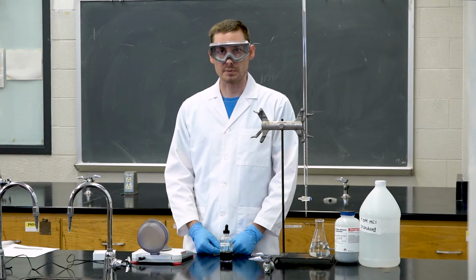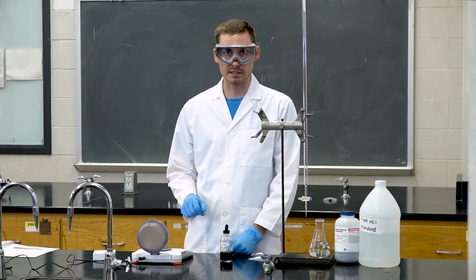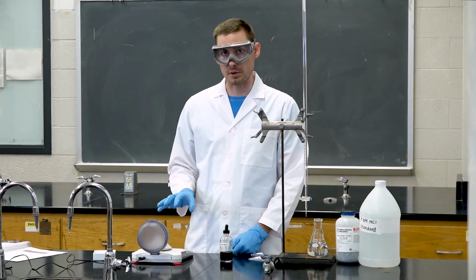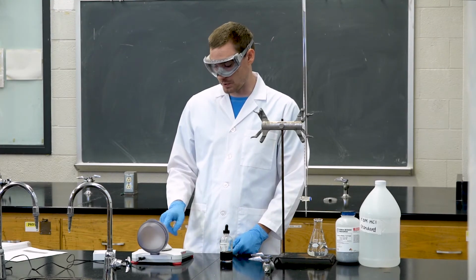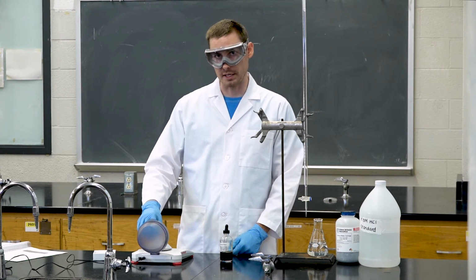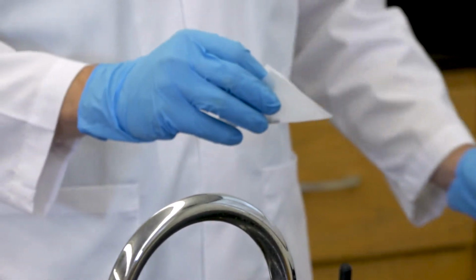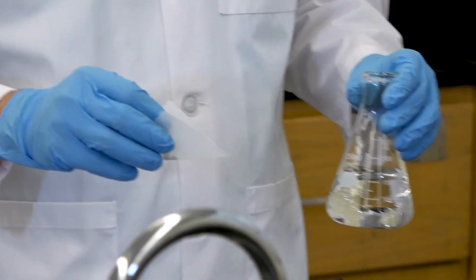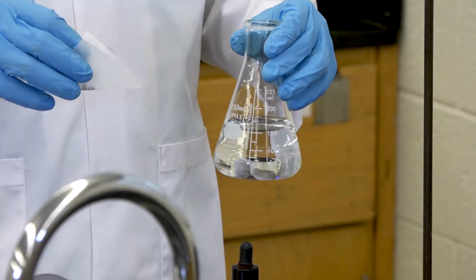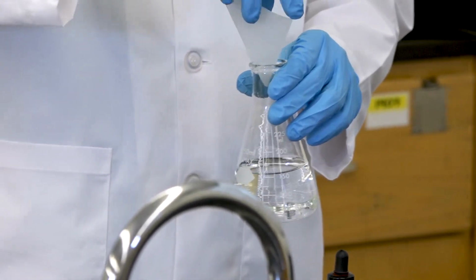So to start with this experiment, we're going to first again need to weigh out a mass of calcium metal using the balance. So once we have recorded the mass of calcium, you need to write down this number in your lab book so that way you can use it later in the calculations. We can then take the weigh paper and add it to 150 milliliters of deionized water in an Erlenmeyer flask.